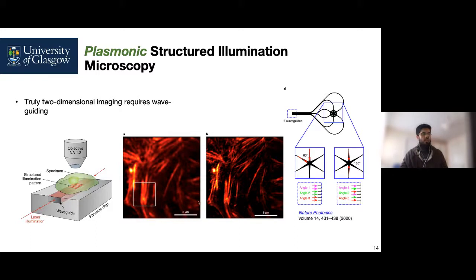Now, this is basically one demonstration that this paper made using excitation from plasmons from the sample stage rather than illuminating it from the top.